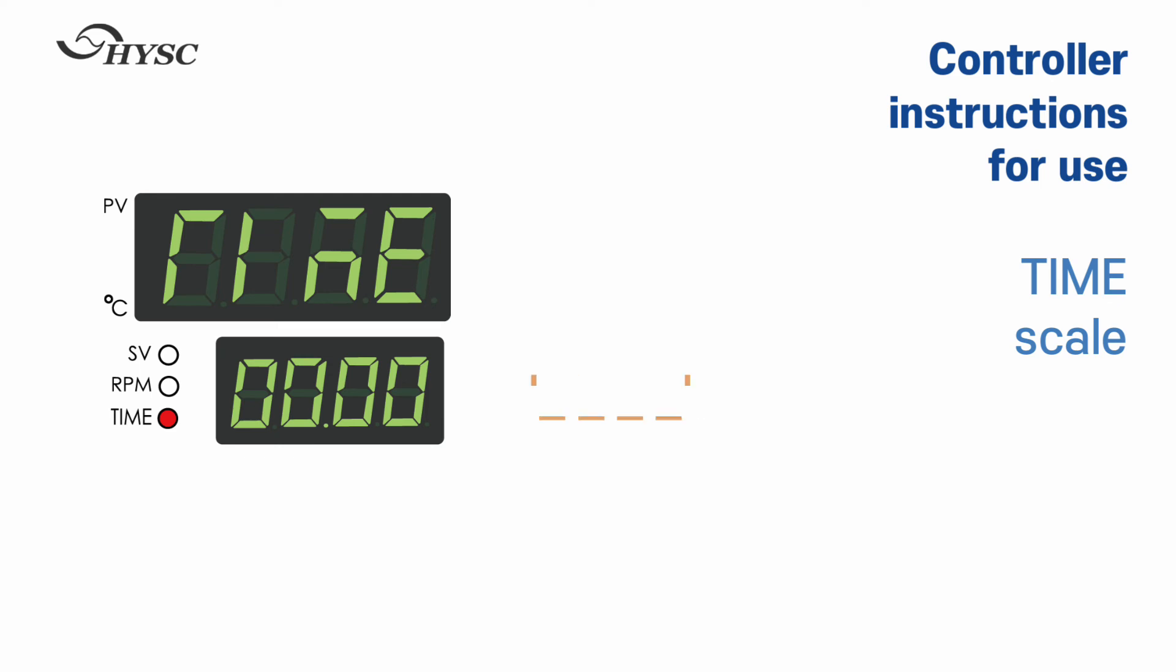If the time is not set, under bar is displayed and the time setting is infinite.